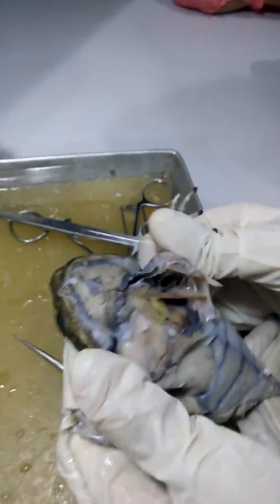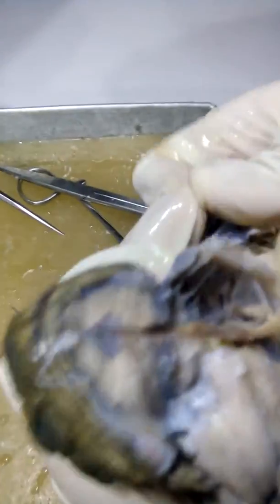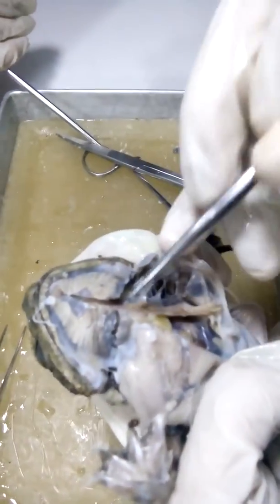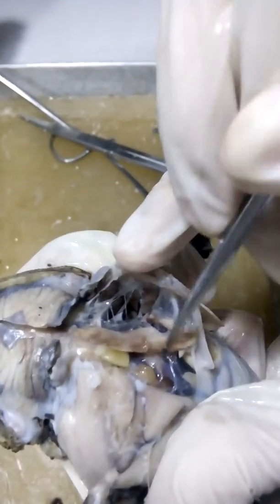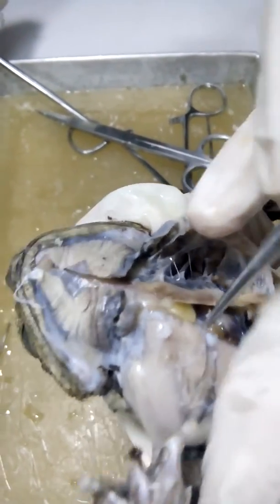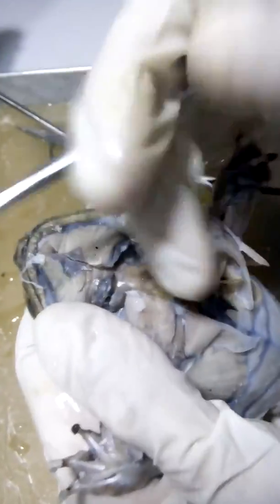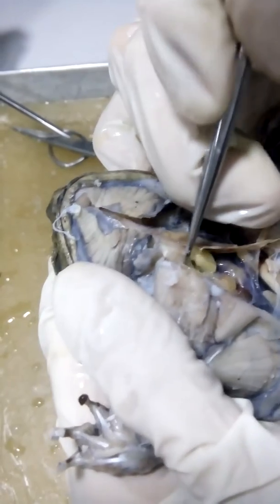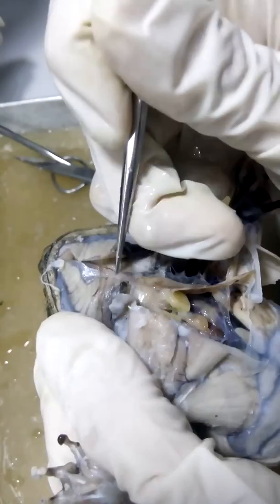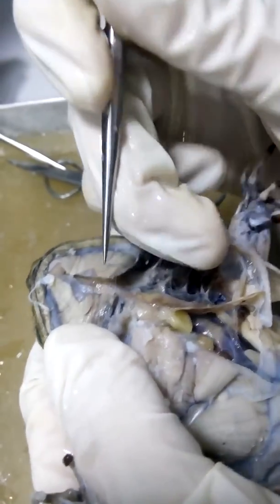Opening that, now we can see this very long muscle, which would be your sternohyoid. Okay. And then this right here would be your hyoglossus. And then anterior to your hyoglossus, covered by your geniohyoid, would be your genioglossus.